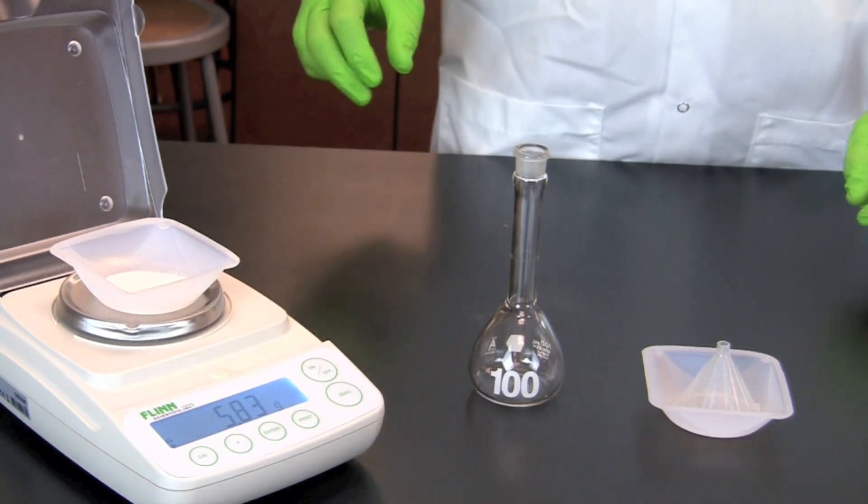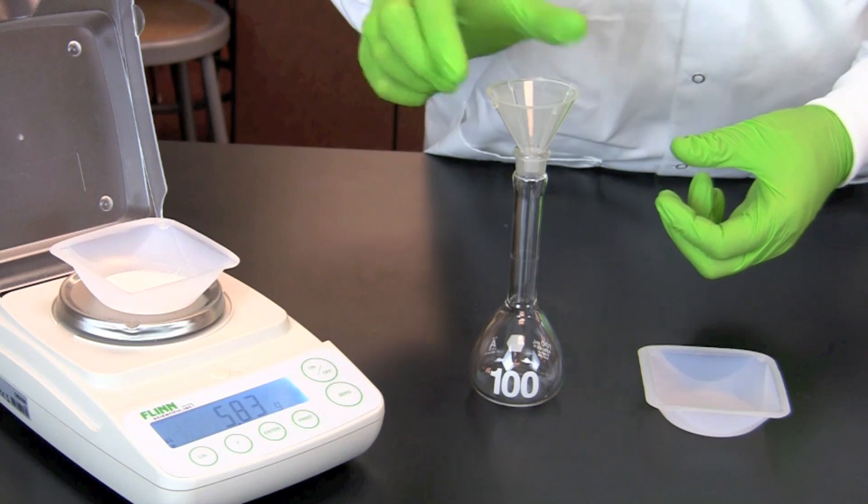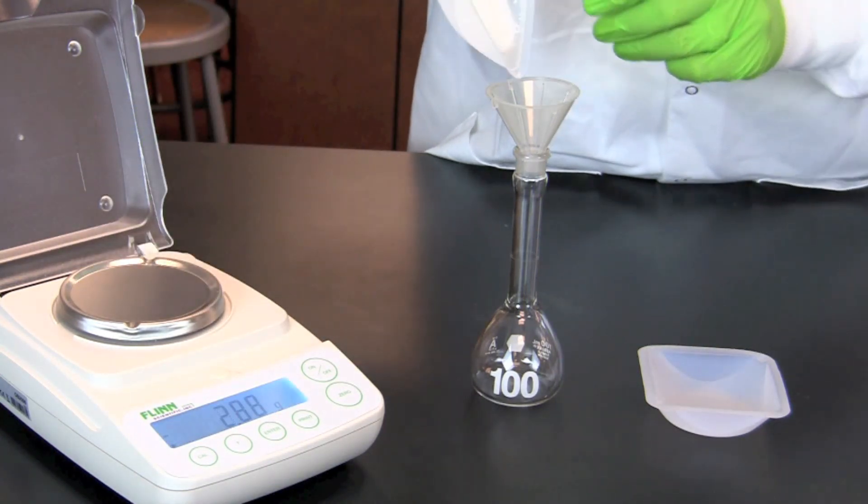The solution will be made in a 100 ml volumetric flask. To get the sodium chloride into the volumetric flask, we first place a powder funnel on top of the flask.